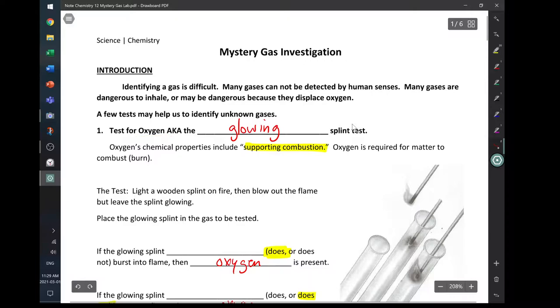So the first one is this test for oxygen and it's also known as the glowing splint test. Oxygen's chemical properties include supporting combustion. Oxygen is the second most reactive element in our universe but at this point is really important because it supports combustion. It supports burning. And that's really what we're going to look at. We're going to look at whether something burns and if it does then we're going to assume that oxygen is present.